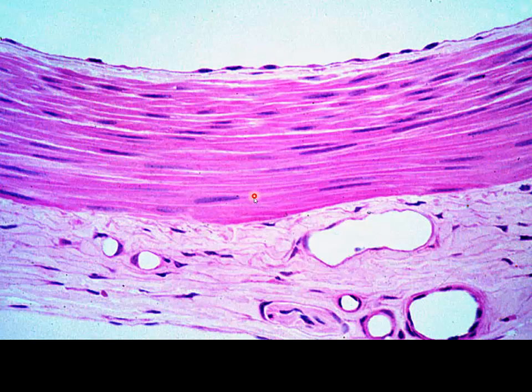And then we get the tunica media, smooth muscle cells. We've got some elastic lamina running through here, but predominantly we see the smooth muscle. And then we have our tunica adventitia. Notice in this, we do have blood vessels in the adventitia, so do you recall what we term collectively these blood vessels in the adventitia of blood vessels? It's called vasa vasorum. And then we also have a little nerve bundle right here, also present in our tunica adventitia.